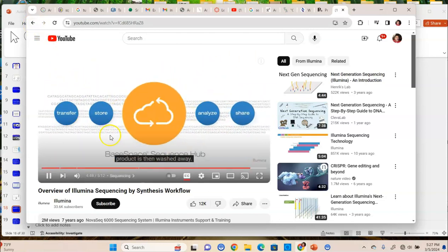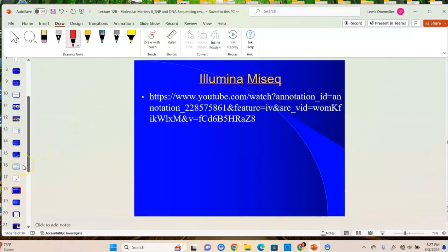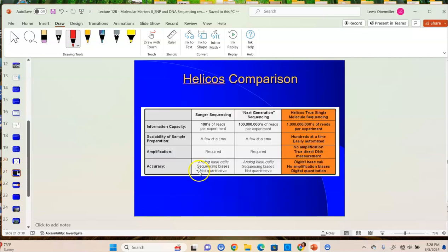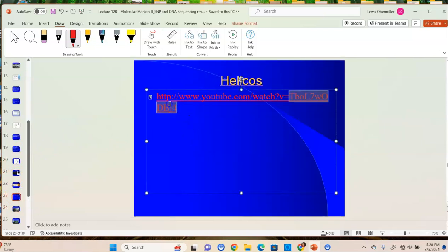All right, so they have bioinformatics software that allows you to read the proprietary sequencing method, which is fine. So Helicos does the same thing. I'm not going to go through the whole process because it doesn't really matter. But Helicos can actually, their detector is sensitive enough that it can actually see one. So it's not using color, it's using a fluorescent image, but it knows what letter's been put in. So instead of reading different colors, it's just reading, is it lit up or not? And so I'll show you real quick how Helicos works.